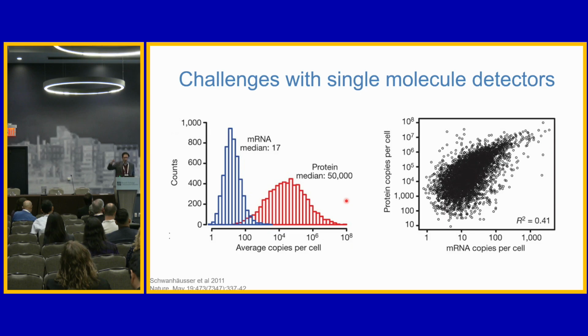But let's try to tackle that up even to a global approach, where we're thinking about kind of like the copies per cell that we're actually making measurements of. In those particular cases, for every copy of this protein, and remember there's e to the 8th up here, we have to read through at least one of the, like we have to read through e to the 8th of those before we start seeing stuff down here. Does that make sense?